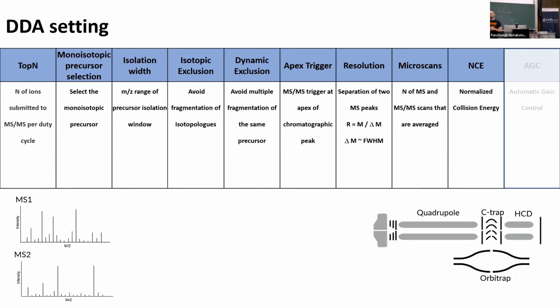Yeah, I fully agree. One drawback of the step is that all the data is merged into one spectrum. Yeah. It would have been good to have 3 files. Yeah.